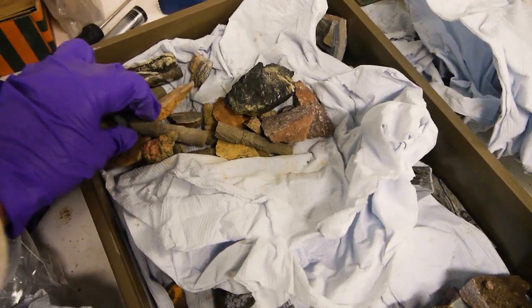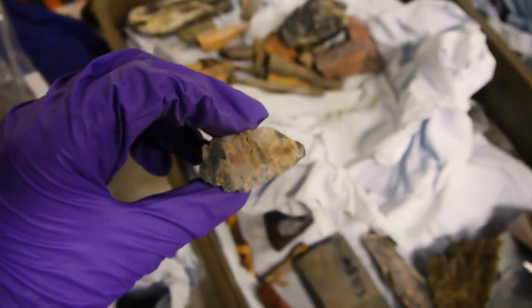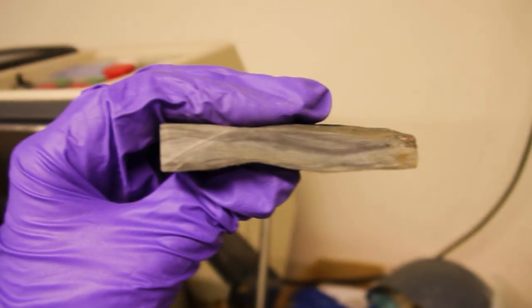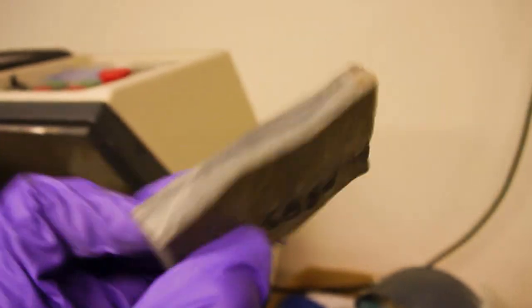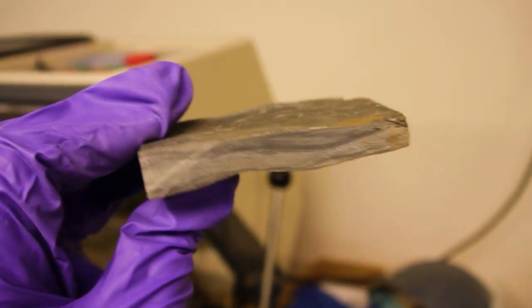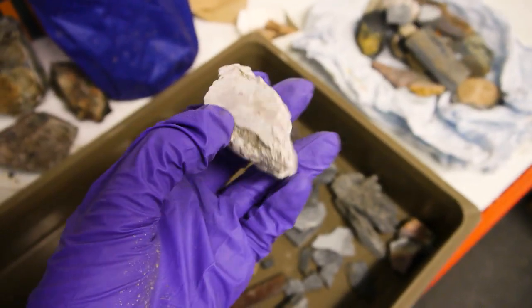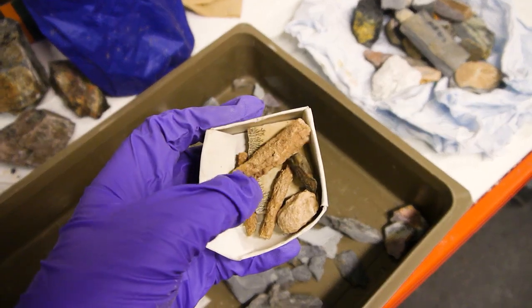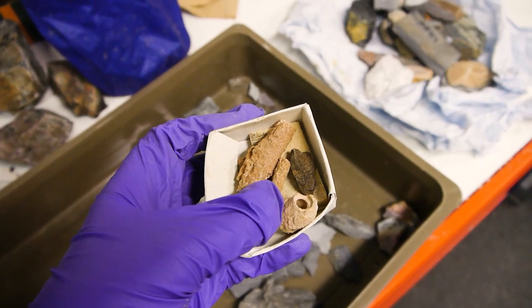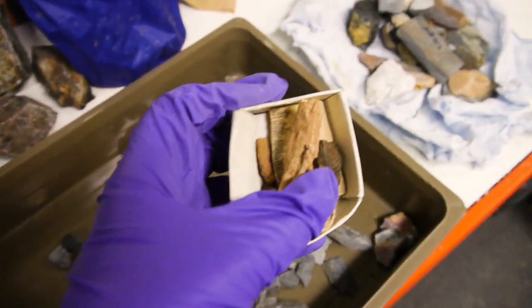This is all stuff I've been making into thin sections. There's a Devonian orthocone nautiloid I found in a desert in a fossilized reef. Some kind of schist and mineralization. Some coal. Some lovely Carboniferous siltstone — look at that crossbedding, it's fantastic; you can actually see it in the rock. That's from Pembrokeshire near Amroth, I think. Nice big chunk of barite — this always feels way heavier than it looks because it's basically barium sulfate and loads of rare earth metals. In here we have fossil reed roots from an 8,000-year-old swamp in the Sahara, fossil locust or bee cocoons from Lanzarote, a bit of Devonian trilobite from Morocco, and some nice manganese dendrite bits.